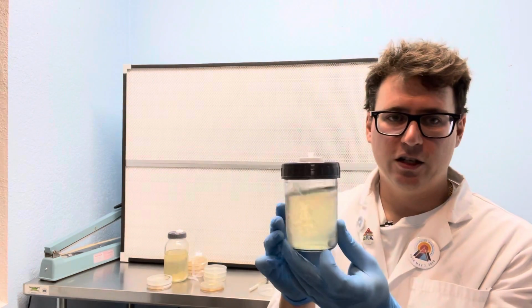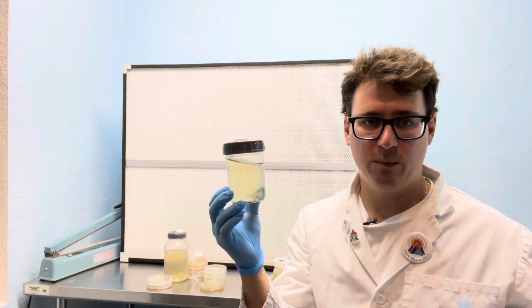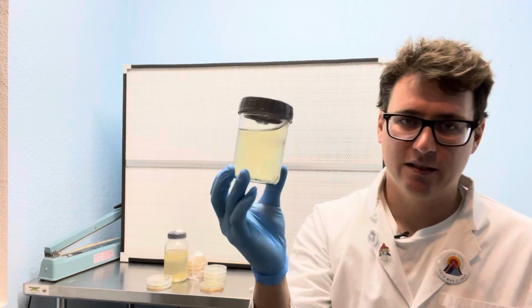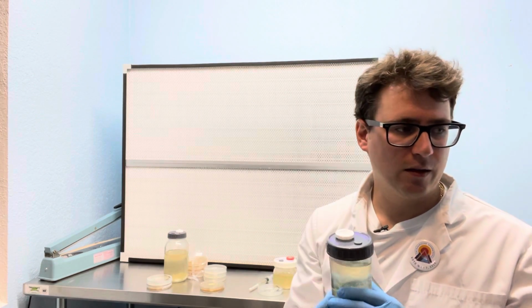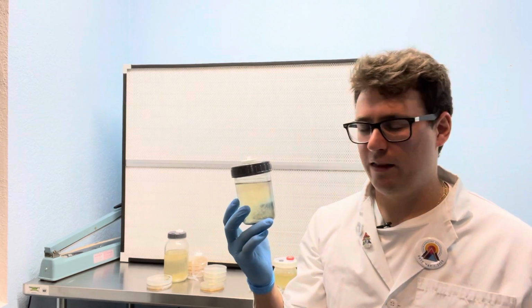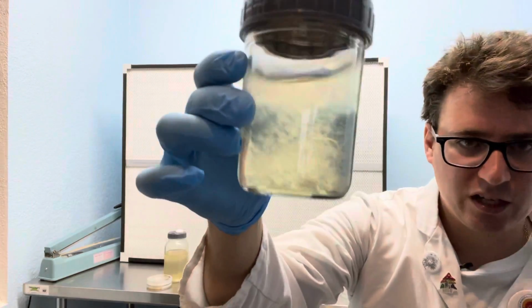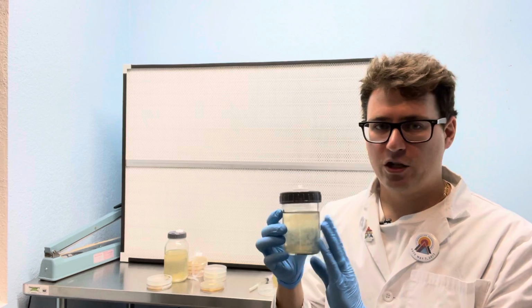Our liquid cultures, we make them from a 4% honey solution. We use Bjorn's honey from Boulder, Colorado. It's a local honey source, and it's been working amazing for the past few years. With some of the more difficult strains to cultivate, we will supplement our solution with either tryptic soy or other proteins to allow the mushrooms to adapt more to the solution. But for the most part, it's just sugar water and then a three-dimensional matrix for the mushroom to grow.